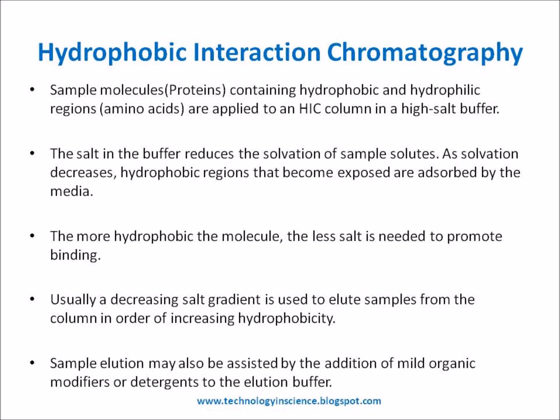Usually a decreasing salt gradient is used to elute samples from the column, in the order of increasing hydrophobicity. Sample elution may also be assisted by the addition of mild organic modifiers or detergents to the elution buffer.